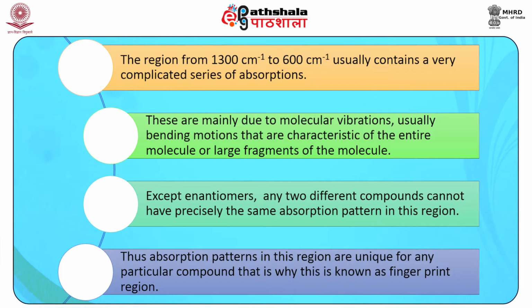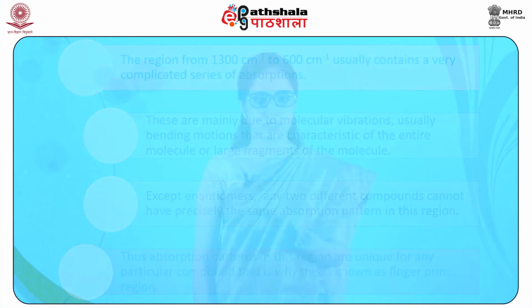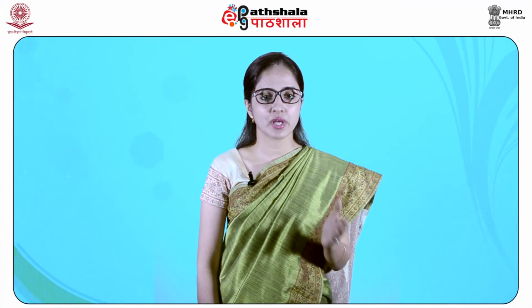Thus, absorption patterns in this region are very unique to any particular compound. That is why it is also called the fingerprint region. As you know, fingerprints are unique to every person on this earth. That is why this region is also termed the fingerprint region.